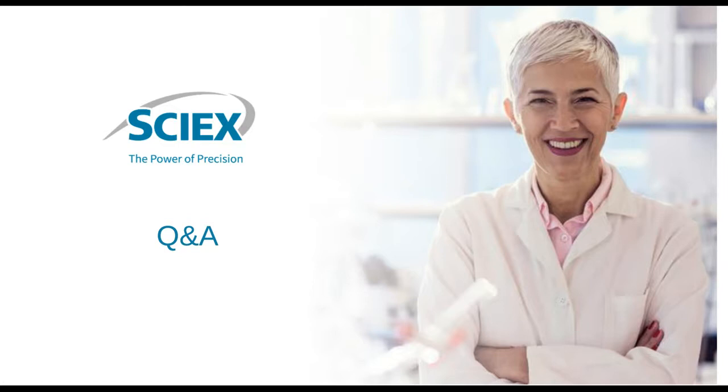Yeah, with this project, it's quite new. We haven't fully elaborated the whole dynamic range. But in general, the instrument has a dynamic range of 5 to 6 orders of magnitude. For this kind of analysis, we didn't need that because we didn't monitor all the kind of ingredients in there. But I guess we will go in the same direction. There's more to be tested here.